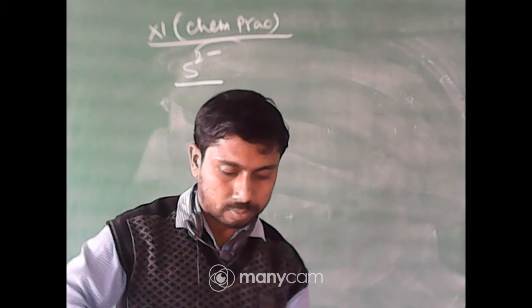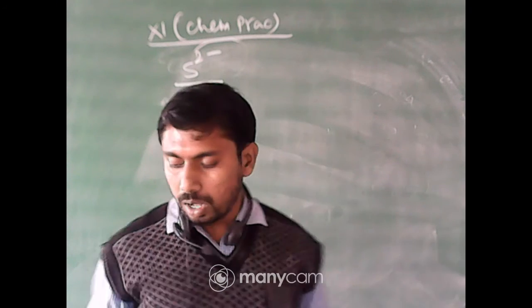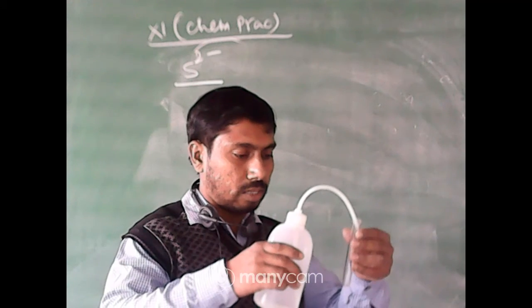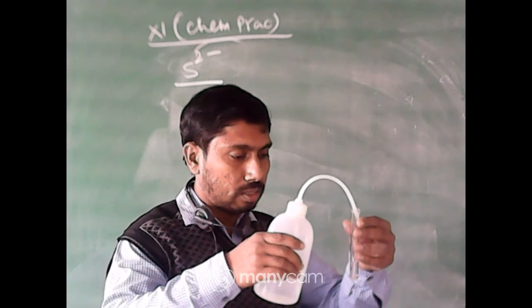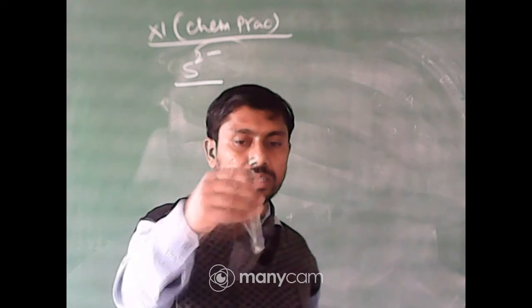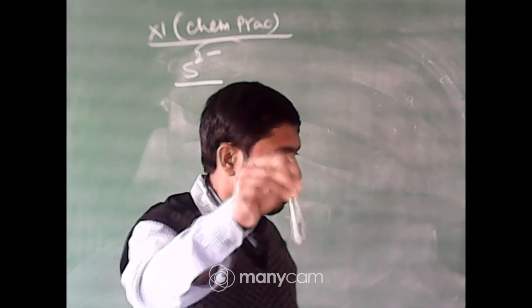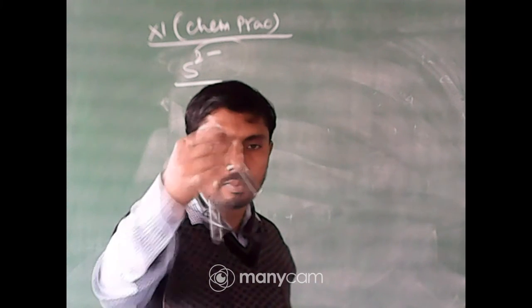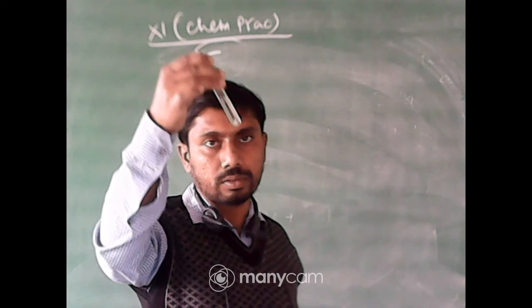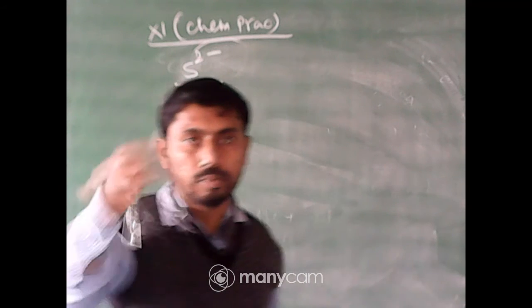Now I will add here water, just like the theoretical part. Around 8 ml of water added. Now shake it well. Shake it till now residue is there at the bottom.